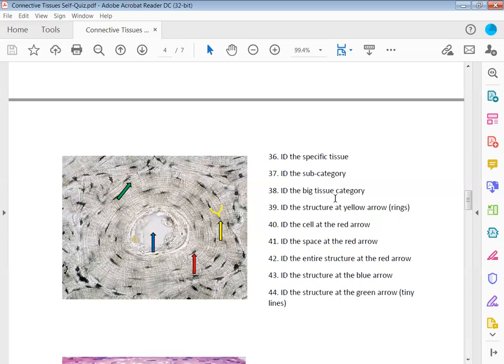So you can't really tell it on a microscope slide unless it's focused in a lot more than this one is. But just like in the cartilages, you have a little bitty air pocket or space pocket with the cell inside of it. So remember, your space pocket is the lacunae. And here with bone, we can't call it a chondrocyte because chondro meant cartilage. So now we have to call that little cell an osteocyte. Osteo means bone and cyte means cell. So an osteocyte is a bone cell.